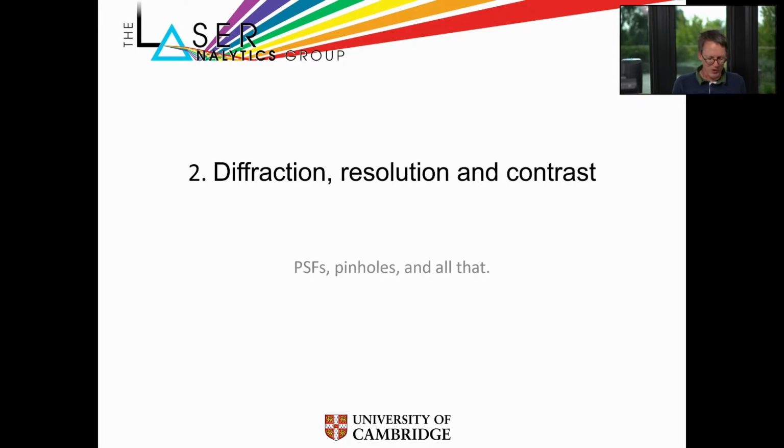So some of the important take-home words or concepts I would like to introduce are the PSF, so the point spread function, pinholes, and all other kinds of concepts that we'll go through as we go along.